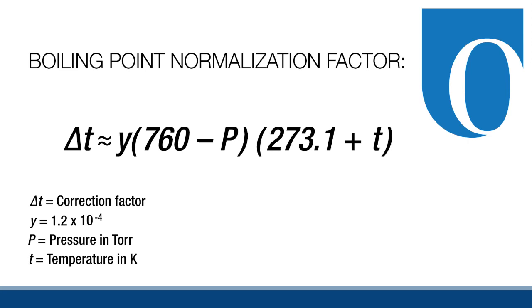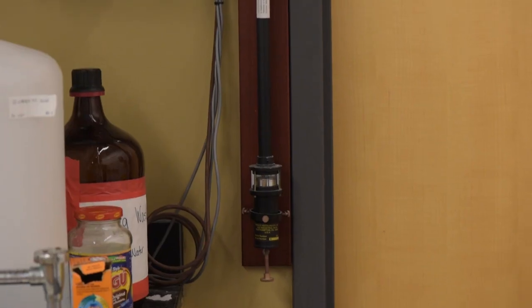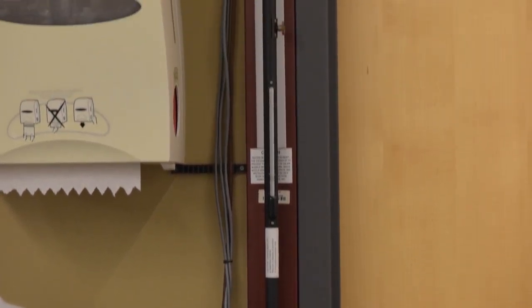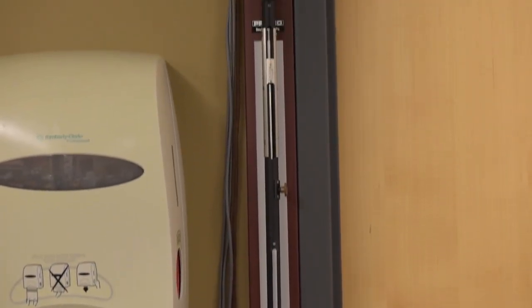Although Toronto is not high enough in altitude to have a significant effect, changes in weather may significantly change the pressure and alter your results. A barometer is available to record the pressure in the lab. For this lab, your instructor will make the measurement for you.